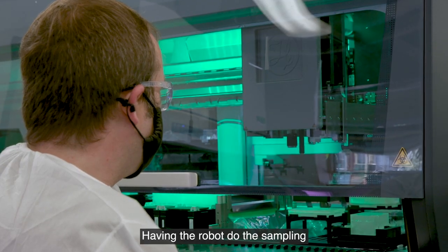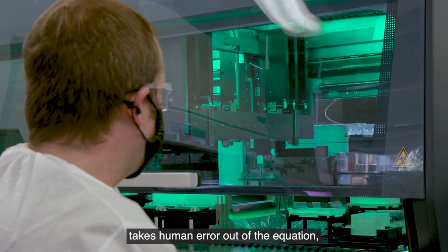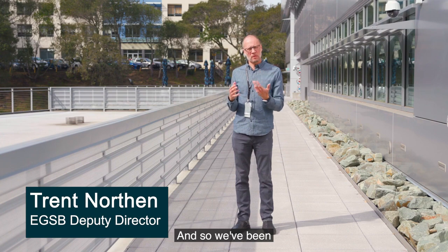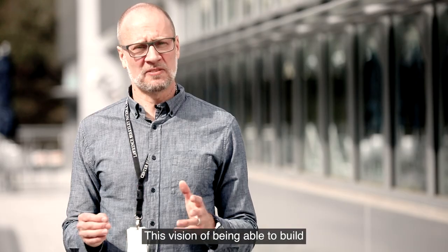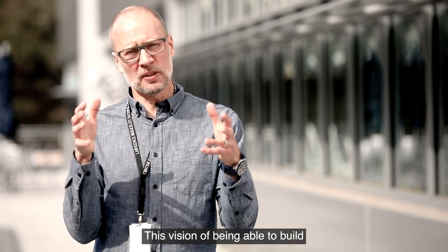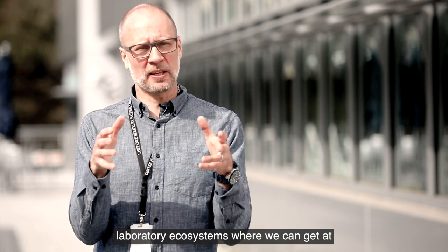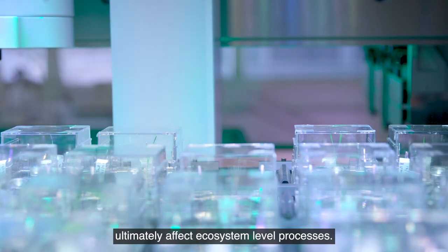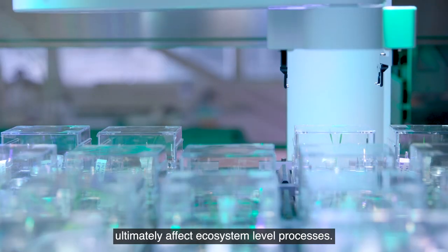Having the ECOBOT do the sampling takes human error out of the equation, making the data much more reproducible. We've been working on this vision of being able to build laboratory ecosystems where we can get at how genes and interactions between organisms ultimately affect ecosystem level processes.